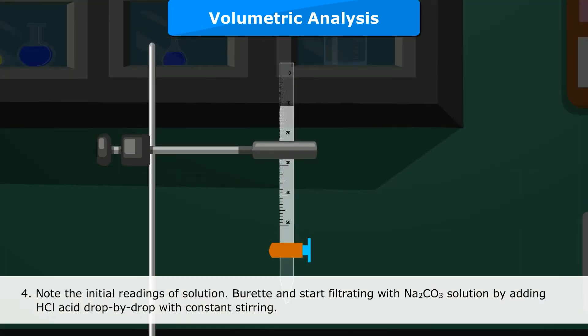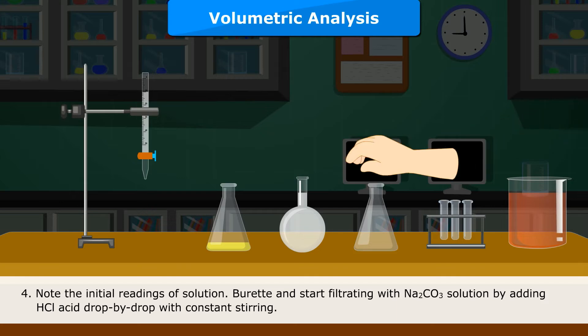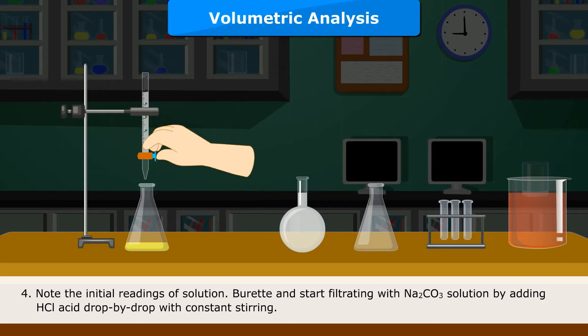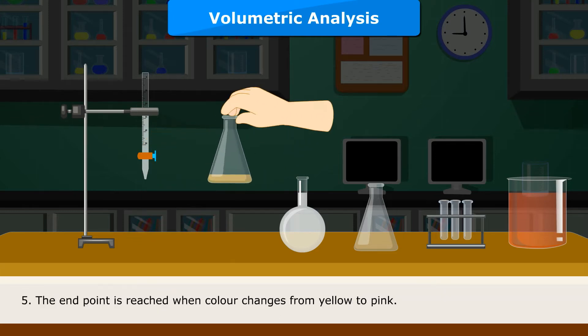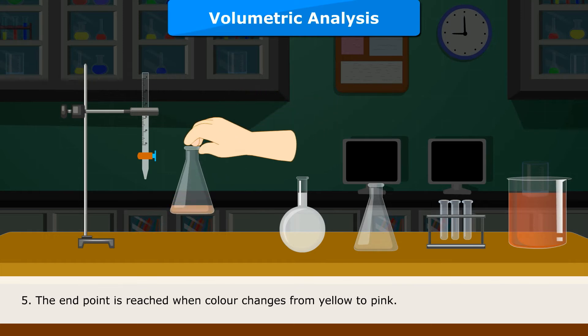reading of solution Buret and start titrating with Na2CO3 solution by adding HCL acid drop by drop with constant stirring. The end point is reached when color changes from yellow to pink.